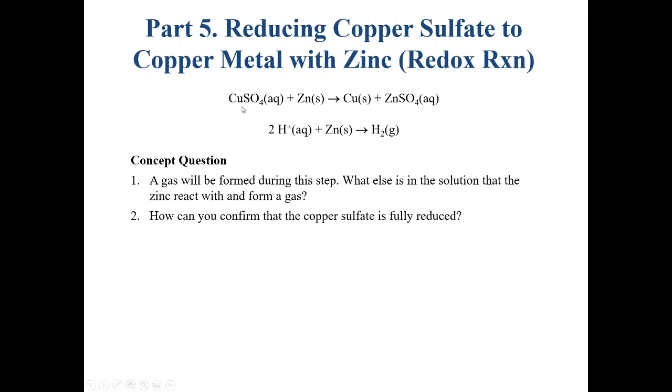So in this case, again, I'm not going to tell you the answer, but I'm going to give you a hint. So on this side, we have copper 2+, and when it's fully reacted, and we've made our product copper, we no longer have copper 2+ hanging around. So that solution is going to change color, and that's going to be an indication of when the reaction is fully complete. So you should think about what color the solution will be to start and what color the solution would be when it ends, knowing that copper 2+ is what's being reacted.